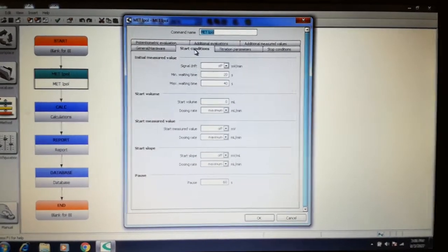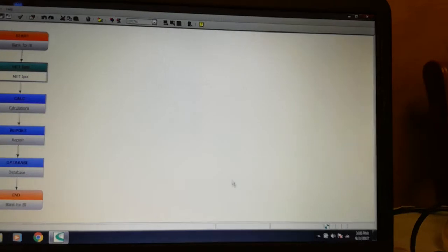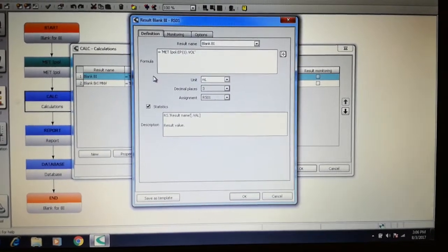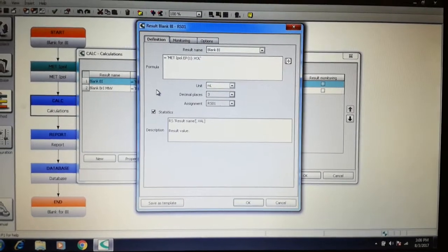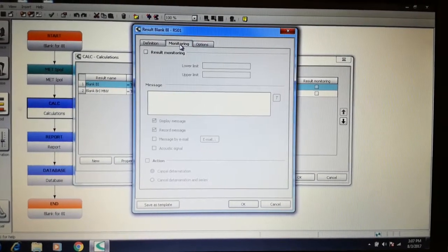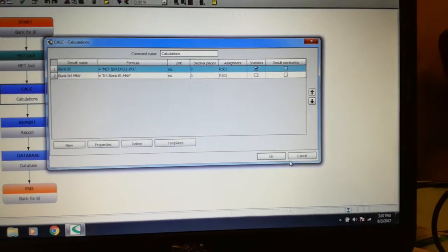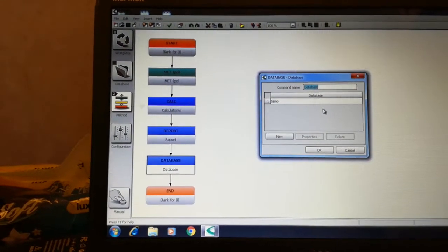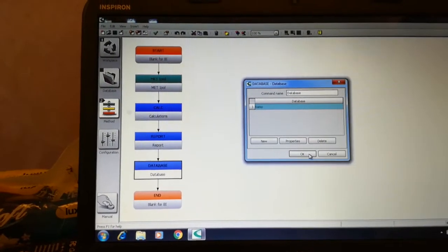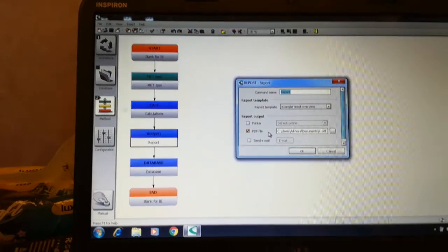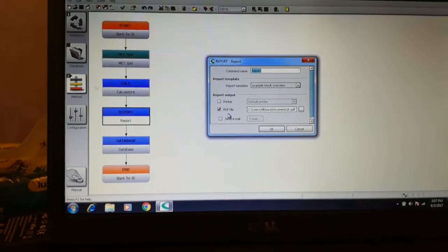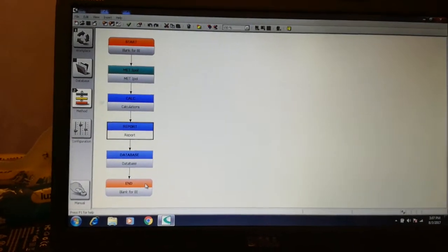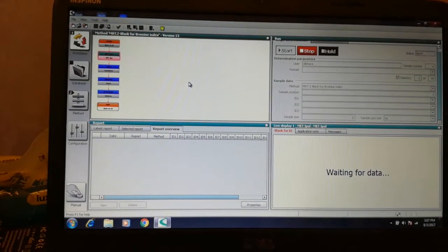Make sure that the settings are identical to the reference. Now let's look at the calculation equation for the blank. The report can be printed in PDF format or sent to the default printer. Now return back and wait for the data.